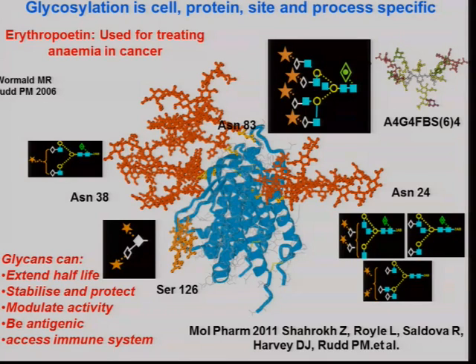But IgG is kind of frustrating, really, because years ago we wanted to look at individual glycoforms of IgG, so you can make G0. It's really easy. You just use the sialidase and galactosidase on the whole molecule, and it works. But to get G2, you can't do it like that. You have to isolate that particular population on lectins, and then the lectins don't get in for the same reason. There's not much room; they don't always get in. So, yeah, it's a challenging molecule, but it's interesting. It's always something new with IgG.